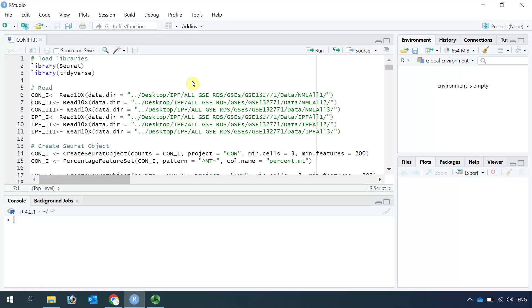In my previous videos, I showed you how to integrate single-cell RNA sequencing data from healthy human lung. One of you asked me to show you how to analyze single-cell RNA sequencing data from fibrotic lung. So today I'm going to show you how to integrate single-cell RNA sequencing data from healthy human lung with fibrotic human lung.